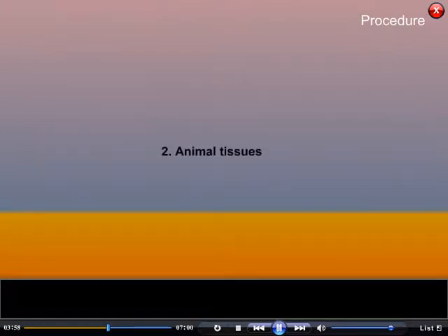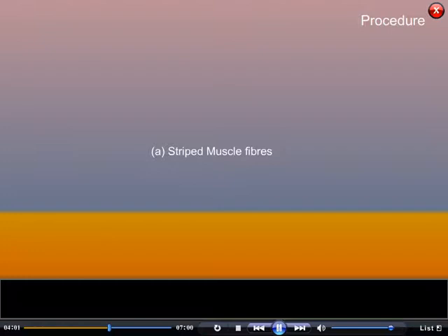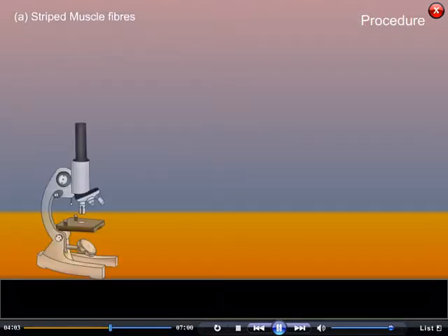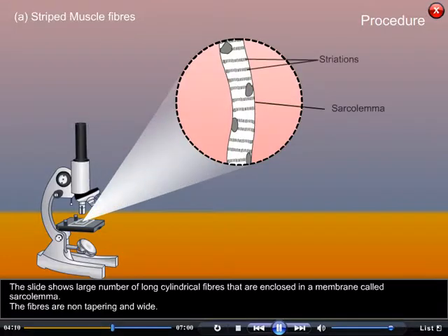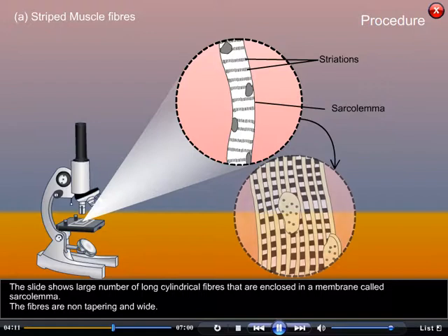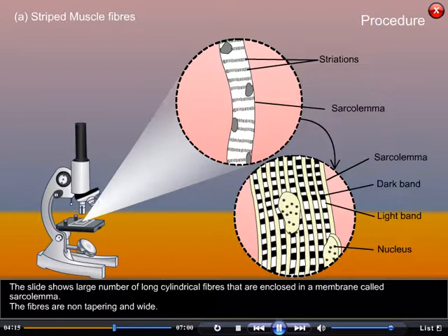2. Animal tissues. A. Striped muscle fibers. The slide shows a large number of long cylindrical fibers that are enclosed in a membrane called sarcolemma.